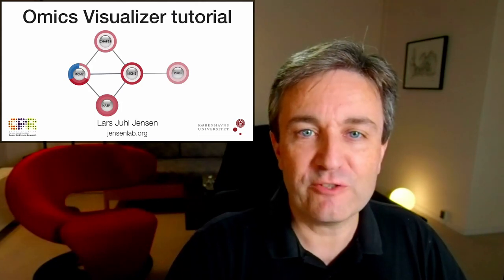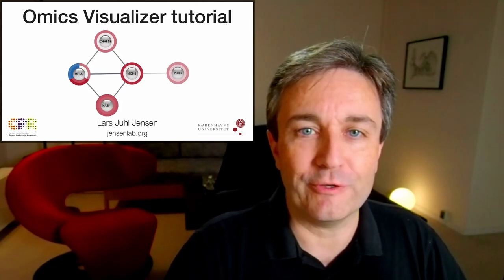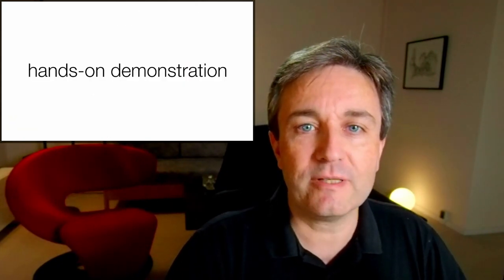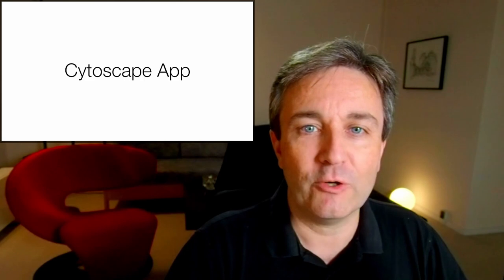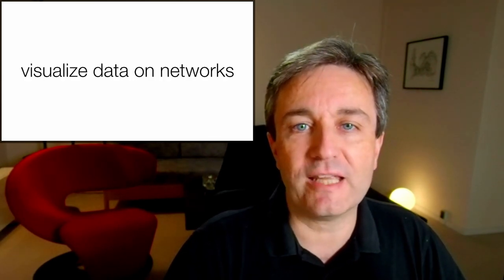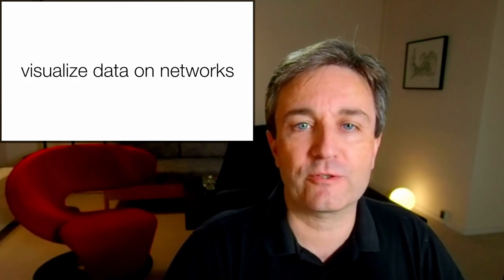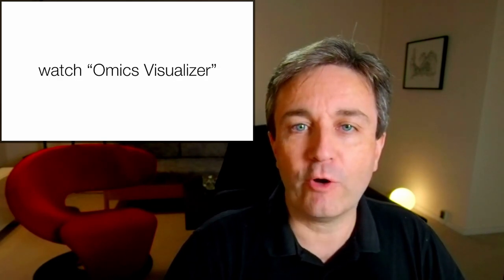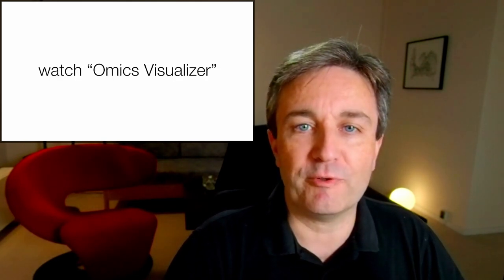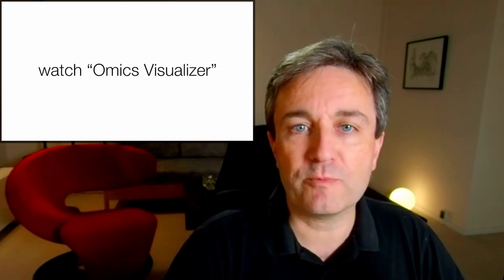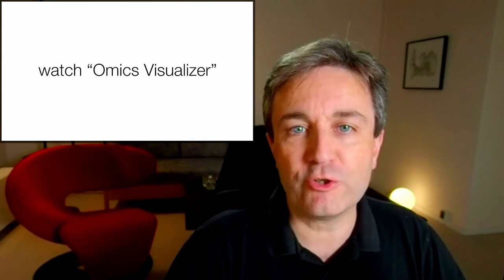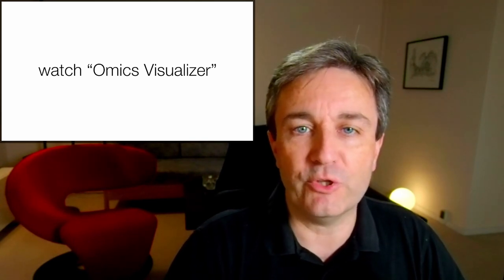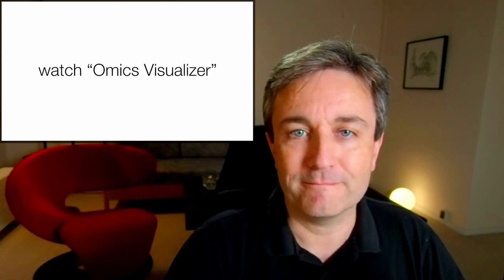Welcome to this Omics Visualizer tutorial. This will be a hands-on demonstration of how you can use a Cytoscape app to visualize complex omics data on networks. If you've never heard of Omics Visualizer before, I recommend that you go watch my brief introduction to the app before continuing with this tutorial.